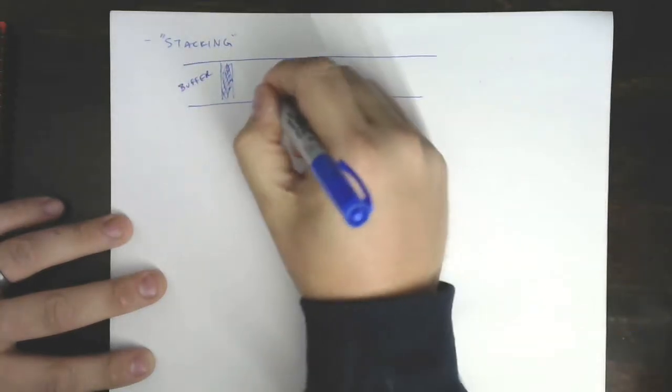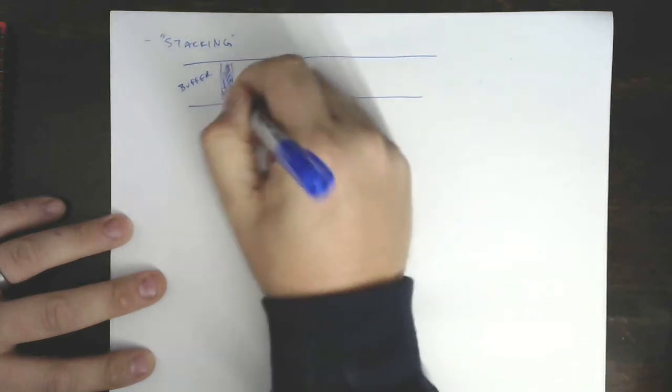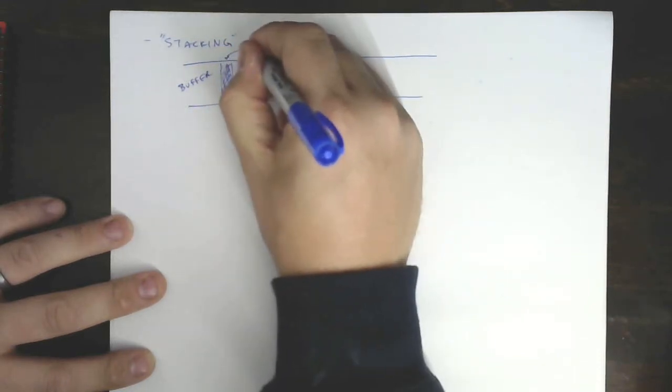And behind this sample, there's going to be buffer. We're going to talk about these injections in a minute. After this sample, there's going to be buffer. And this zone right here is the sample.